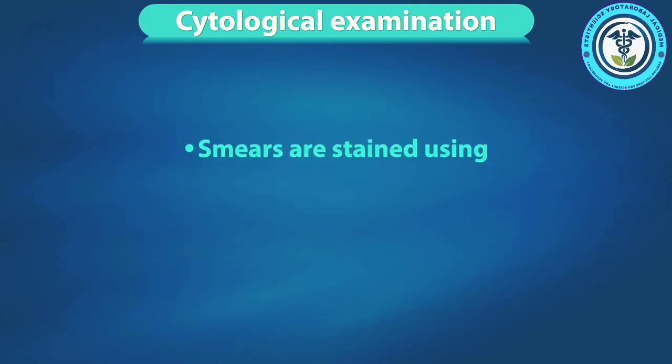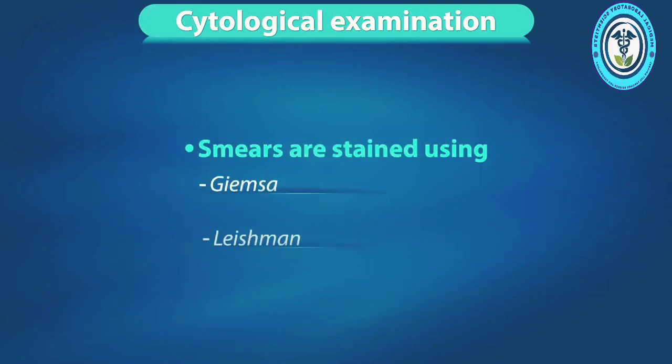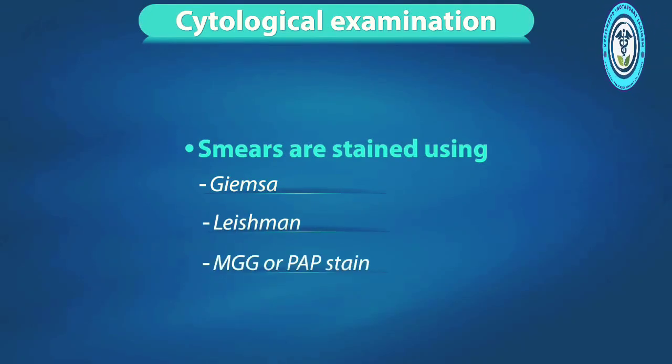The smears are then stained using Giemsa, Leishman, MGG, or pap stain for microscopic examination.